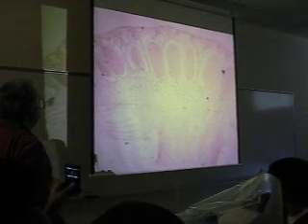Number two, male liverworts. These are the antheridia in the splash platform. That's the antheridium. The whole slide is the male gametophyte. People say, oh, where's the male gametophyte on my slide? Well, the whole damn slide is part of the male gametophyte. So this is the antheridium — multicellular — and these are the sperm. There's actually an exit pore. You may or may not have that on your slide, don't worry about it.